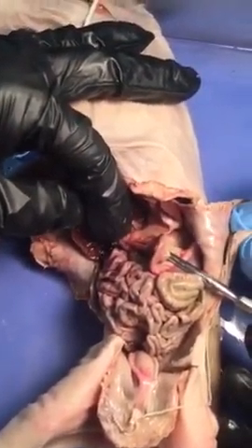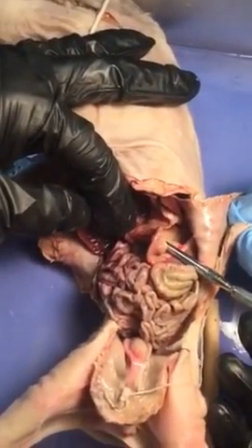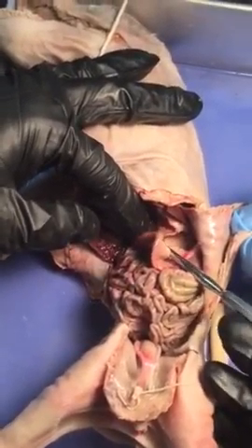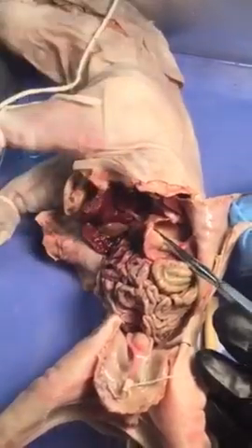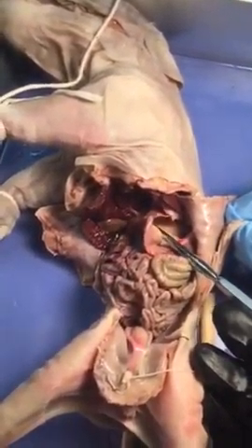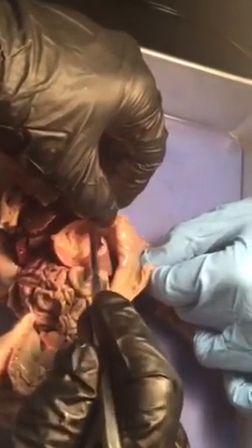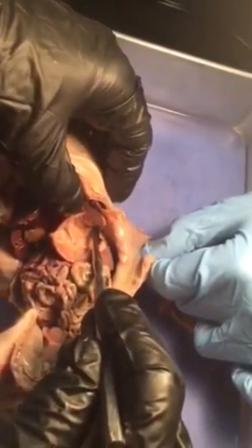And in the pig, I'm not sure how long it is exactly. In humans, it's about the first 9 or 10 inches of the small intestine. Very short region where the food is going to get mixed with all kinds of digestive enzymes and bile and other things. Okay, so that's the pylorus. We've got the rugae. This part up here almost looks like there's a hole up there, but there's not. It's just an extension of the stomach. This region up here is called the fundus of the stomach. That's the most superior part of the stomach.